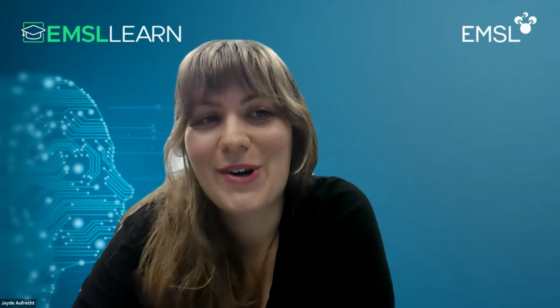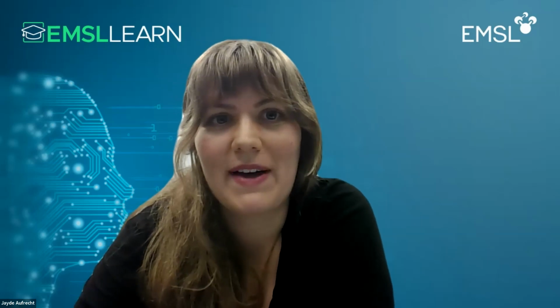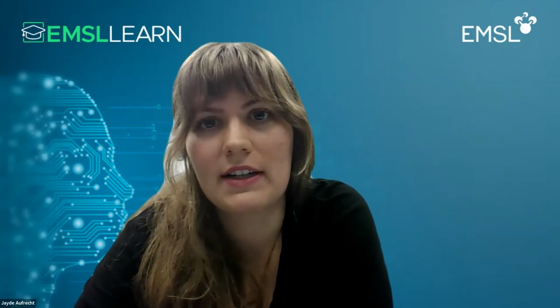I think you could, depending on how long you wanted to grow them for. It might just cut back on the amount of time that you could keep them alive in that small of a space. But I think there's no reason that you couldn't add another inlet and another plant if you're interested in looking at plant root-root interactions or something like that.